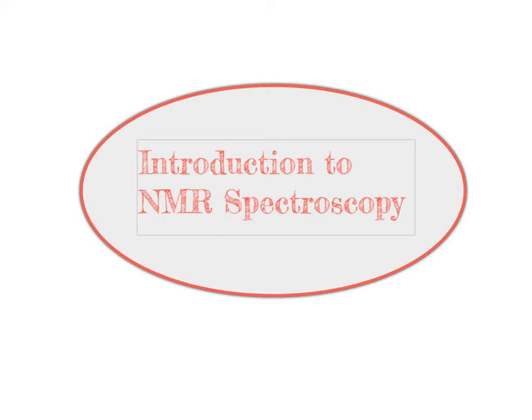In this video, we do an introduction to NMR spectroscopy, which NMR here, as a reminder, stands for nuclear magnetic resonance. We are not referring here to things like nuclear energy, but instead nuclear is referring to the nucleus of the atom. In a nuclear magnetic resonance experiment, the overall goal for the applications we're going to be talking about will be to determine the complete chemical structure of an organic molecule.